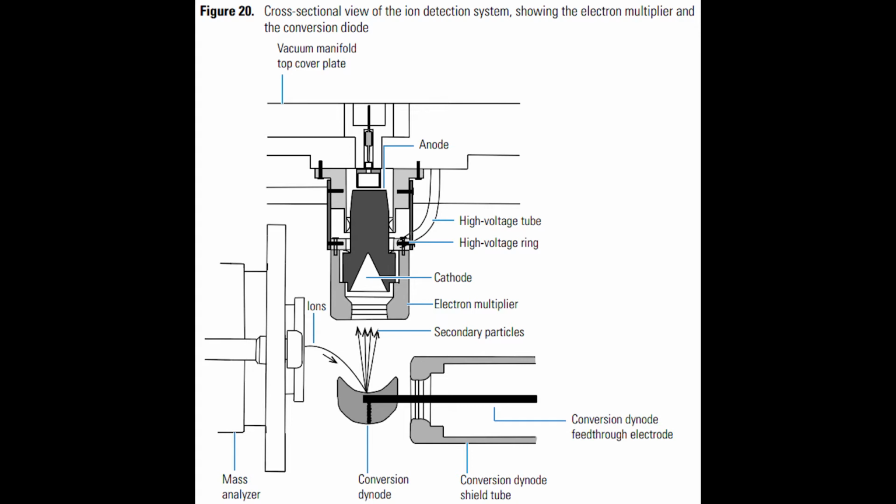So it's true that an ion is moving charge, and we could just directly detect the ion current, in theory, but there's not much signal there for a little packet of ions that have the same mass-to-charge flying out of the mass analyzer. So we really want to amplify. We want to amplify the signal and make it easier to detect. Electrons are pretty easy to detect.